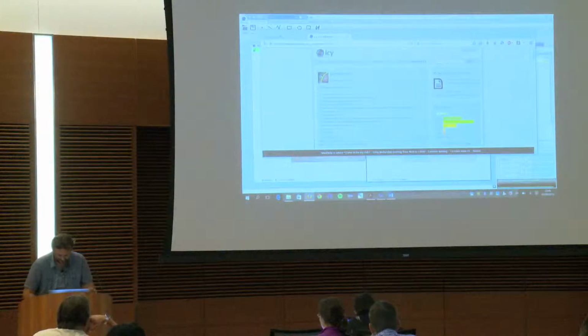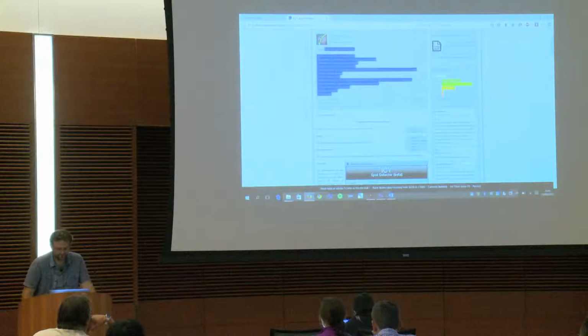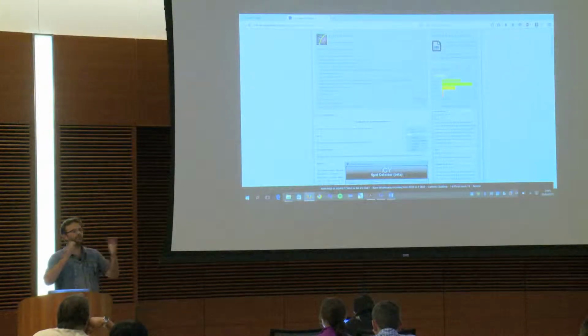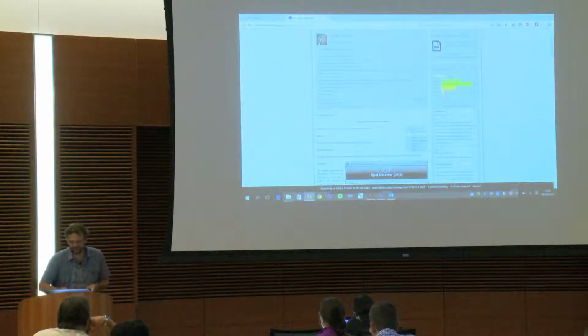Well, a little tour of the website. So here you have a summary of the plugin. You've seen that when you launch Icy, you see a splash screen showing a plugin. It's not really written Icy. It's written Icy, but a little. We try to put forward all the plugins that we have.